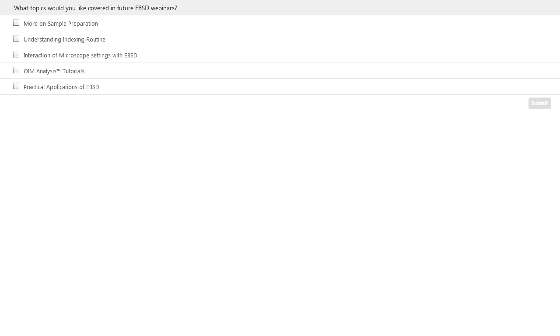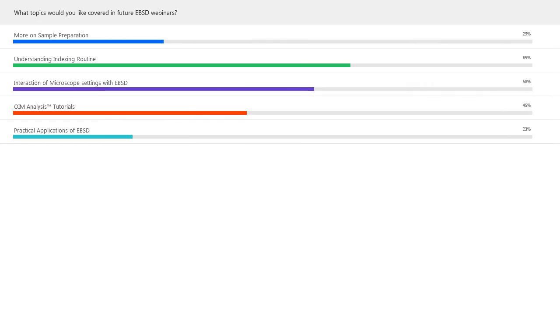Because of that, you don't tend to get that great of indexing out of it. I have what's called a crystalline polymer sample on my desk, but it is not easy to do. If you mean something different by polymer, please let me know. But in general, plastics aren't really EBSDable.